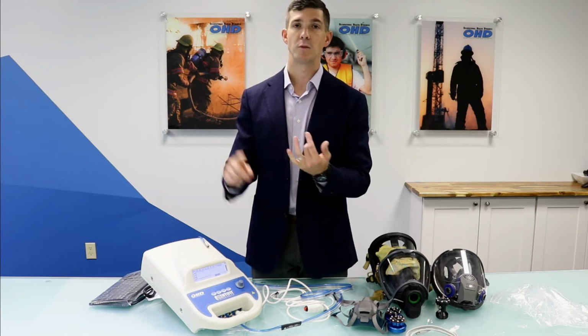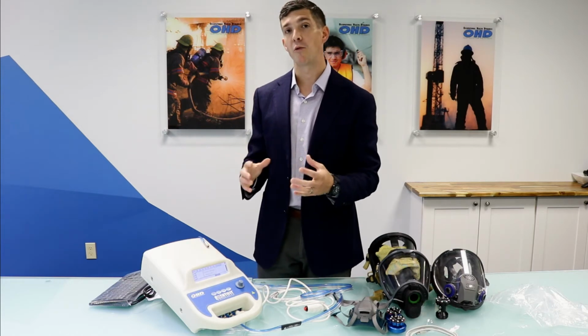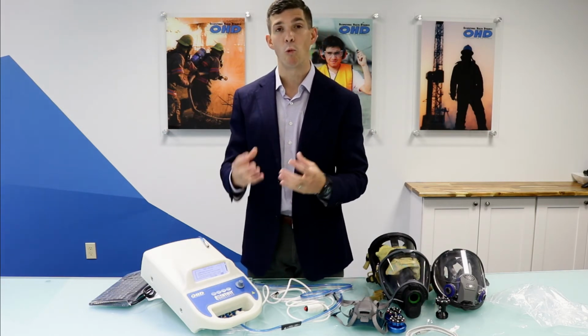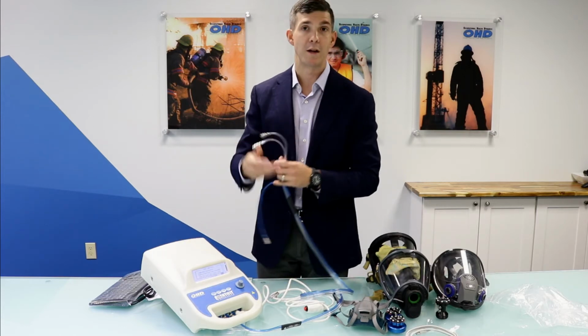You plug up the instrument, you turn it on, you run it through a 90-second calibration, and you're ready to go. So there are no other requirements from environments, from alcohol solutions or anything else that would go in there, wicks. There's no requirements there. Once a calibration is successful, as it says here, we're ready to fit test.